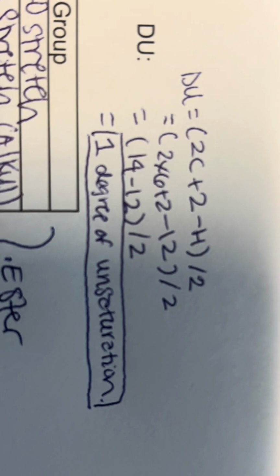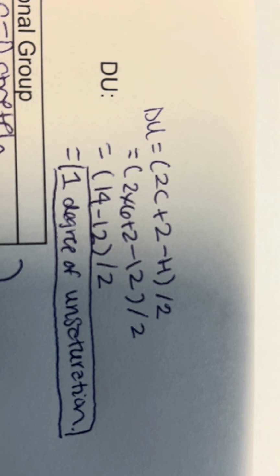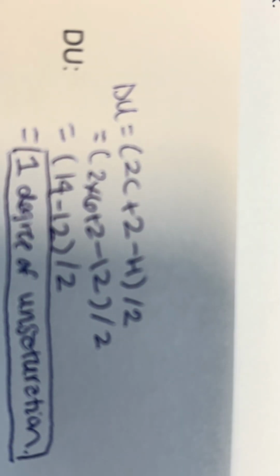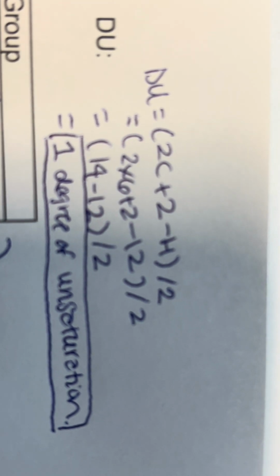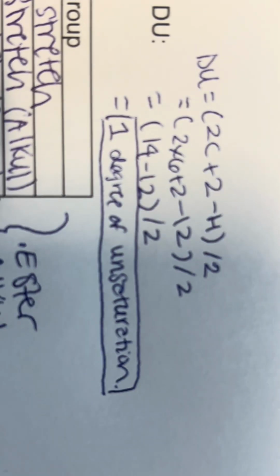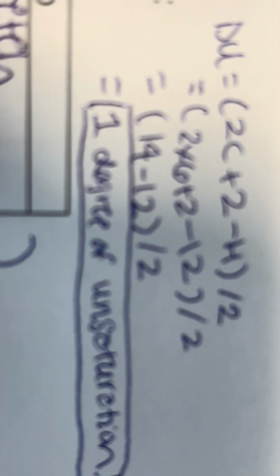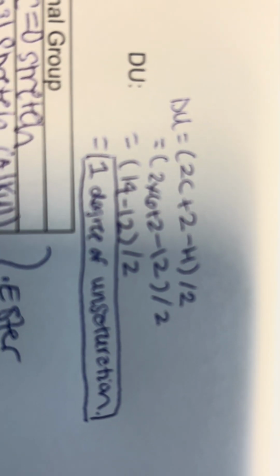So just looking at this first part, to calculate and get an idea of the compound structure, I use the original formula. Degree of unsaturation equals (2C plus 2 minus H) divided by 2. And you can also look at the notated equation right there as I work through it, but we got 1 degree of unsaturation.